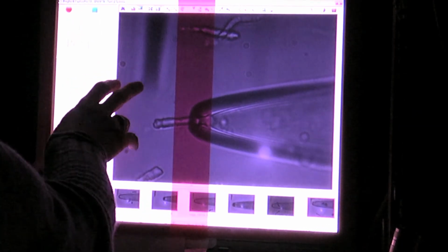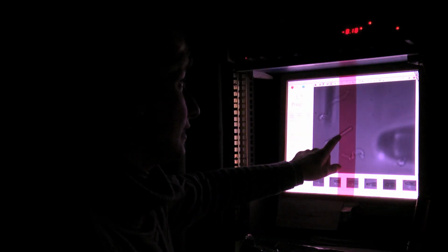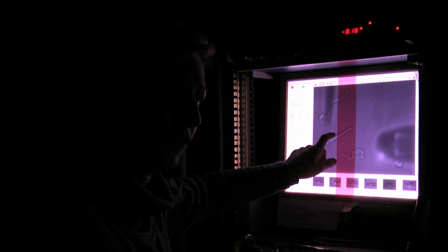And then we use the optical fiber to stimulate in a local way, as opposed to a general stimulation of the cell, so with a diffuse light, we stimulate basically the entire cell. With a localized stimulus, we can observe the response in a specific region of the cell, and so we can study the diffusion of the molecule inside the external segment.